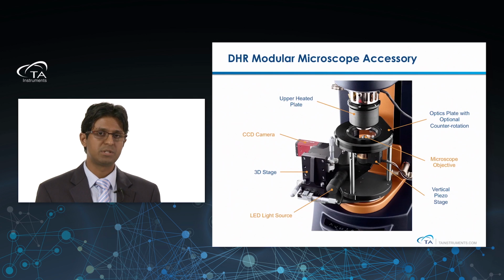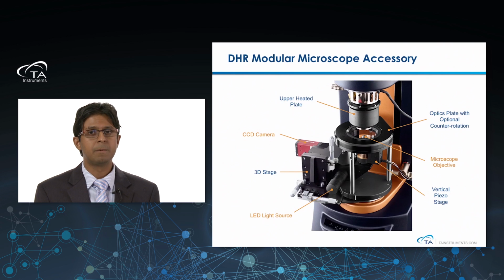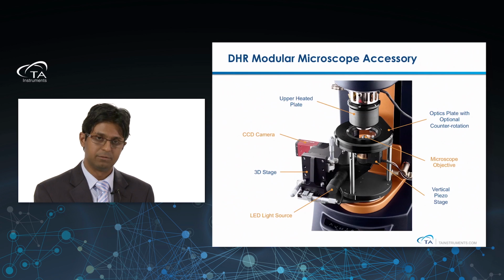We have a couple of different options that are shown here, which is the optional optics plate for counter rotation and a vertical piezo stage that can be used for either 3D structure visualization or for velocity profiling, and I'll get to that in the following slides.